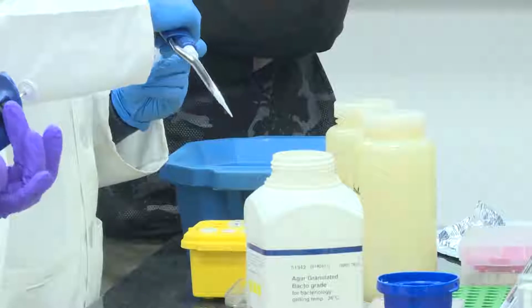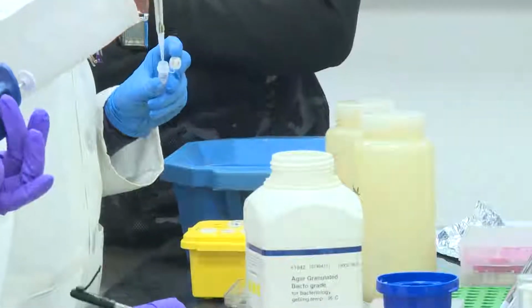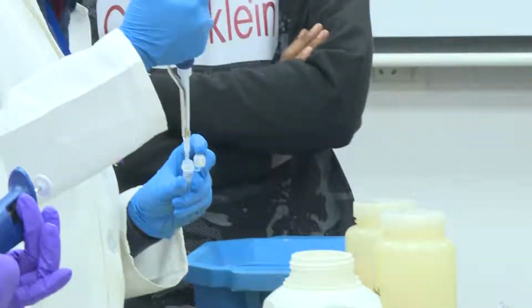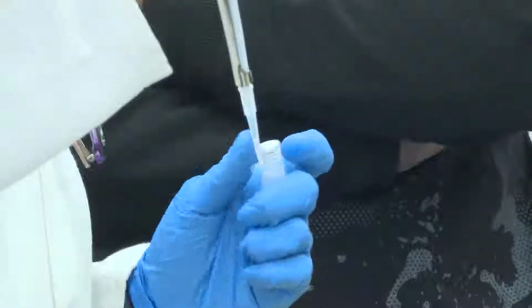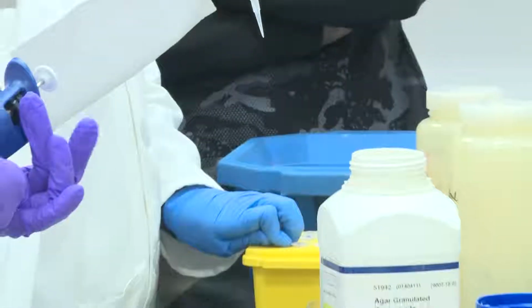And don't think that real-time PCR is the newest development. We have some other additions which have come up in the field, which include droplet digital PCR. We have not discussed it in the class.